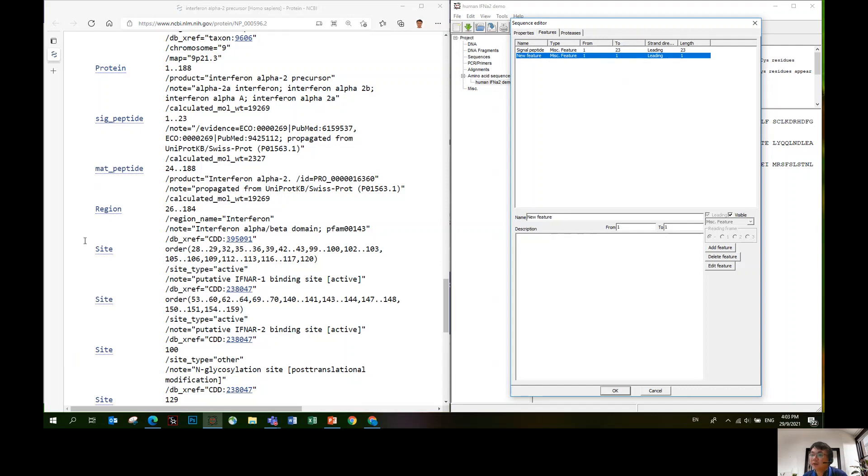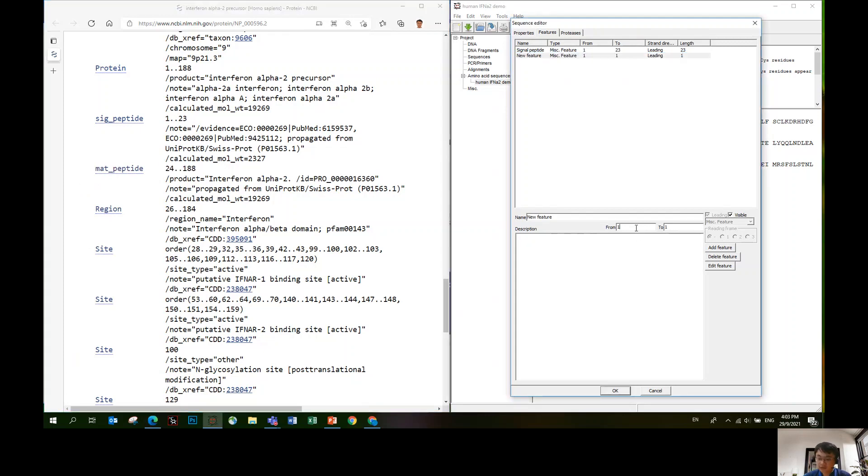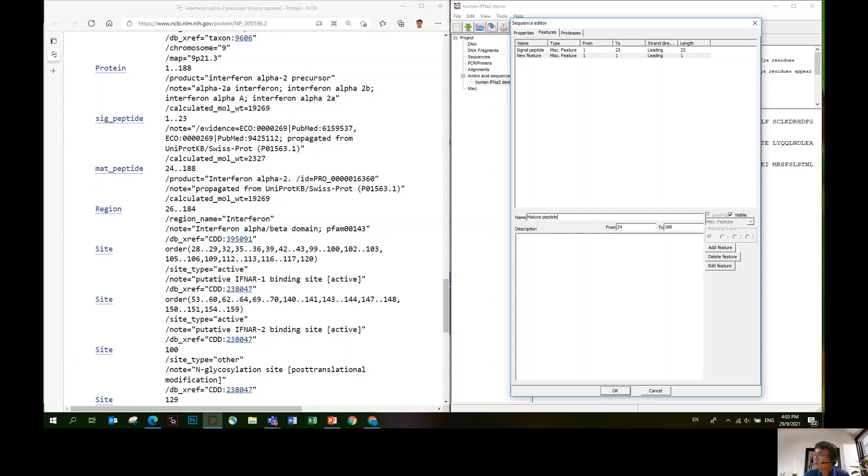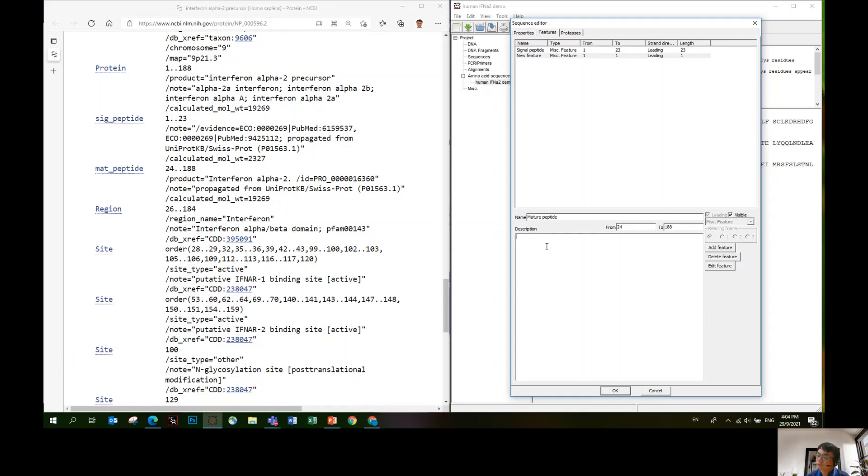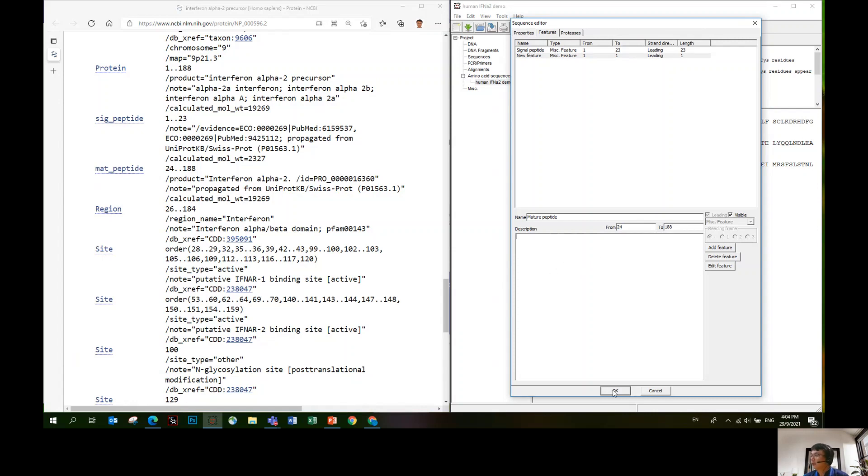The second feature we want to add is mature peptide, 24 to 288. This is called mature peptide because the signal peptide, the first 23 amino acids, will be cleaved upon protein entry into ER. So the mature peptide, that means the final secreted form of interferon A2 will start with amino acid 24, and the signal peptide sequence will be gone. We're done with this. Just click okay, remember to click okay.